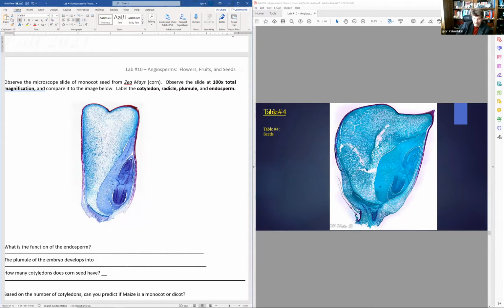All of this right here, all of the light bluish color on the left, is the endosperm, starch. Now the cotyledon, that part right here between the endosperm and the actual embryo, that's the cotyledon. Here's the cotyledon, all this, again between the endosperm and the embryo.